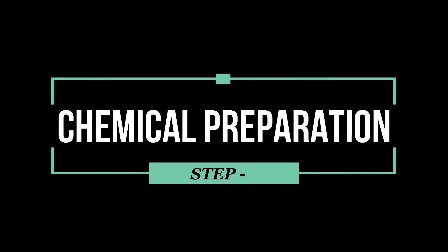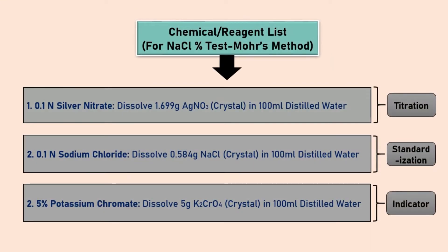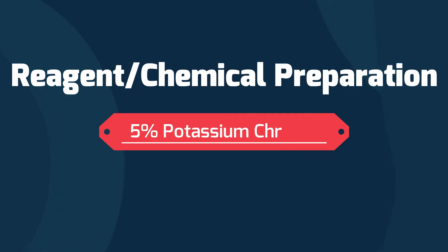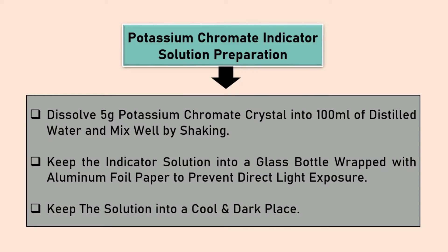Chemical and reagent preparation is very crucial for any test, so we must prepare the chemicals or reagents properly. Before going for the main test, we will prepare 0.1 normal silver nitrate, 0.1 normal sodium chloride, and 5% potassium chromate. 5% potassium chromate can be prepared by dissolving 5 grams potassium chromate into 100 milliliters distilled water and shaking to mix well. Keep the solution bottle wrapped with aluminum foil paper to avoid direct light exposure and store it in a dark and cool place.